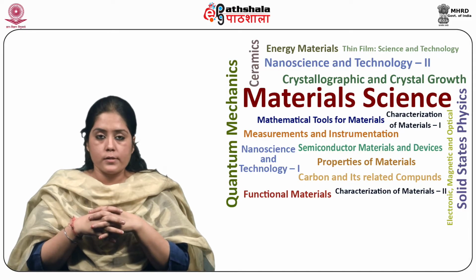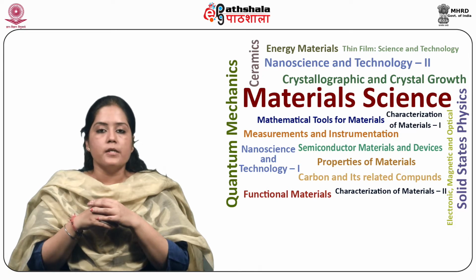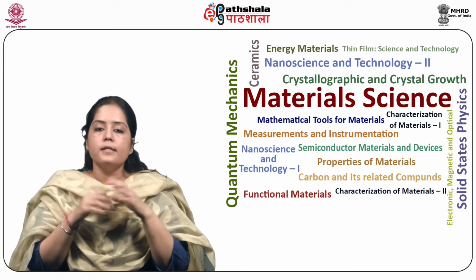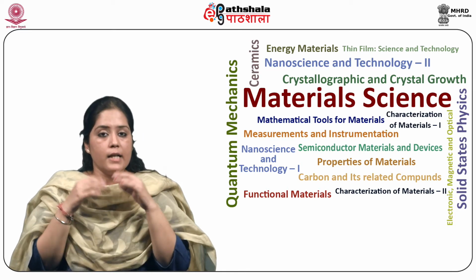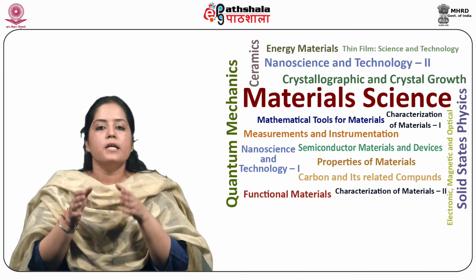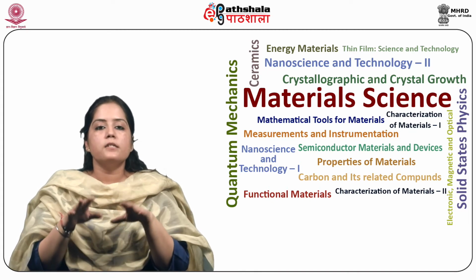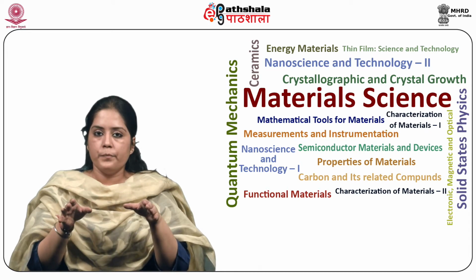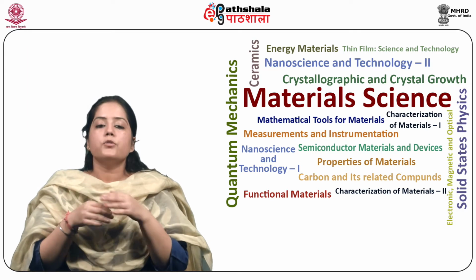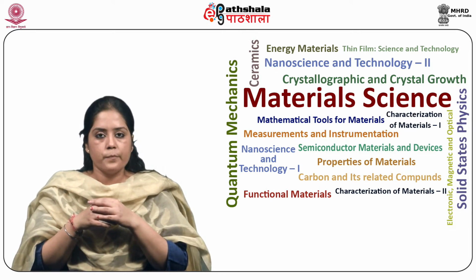Visible light source. A tungsten filament lamp is used as a visible light source. This lamp can produce light in the 350 to 2500 nanometer wavelength range. In a tungsten filament lamp, the energy emitted is proportional to the fourth power of the operating voltage.